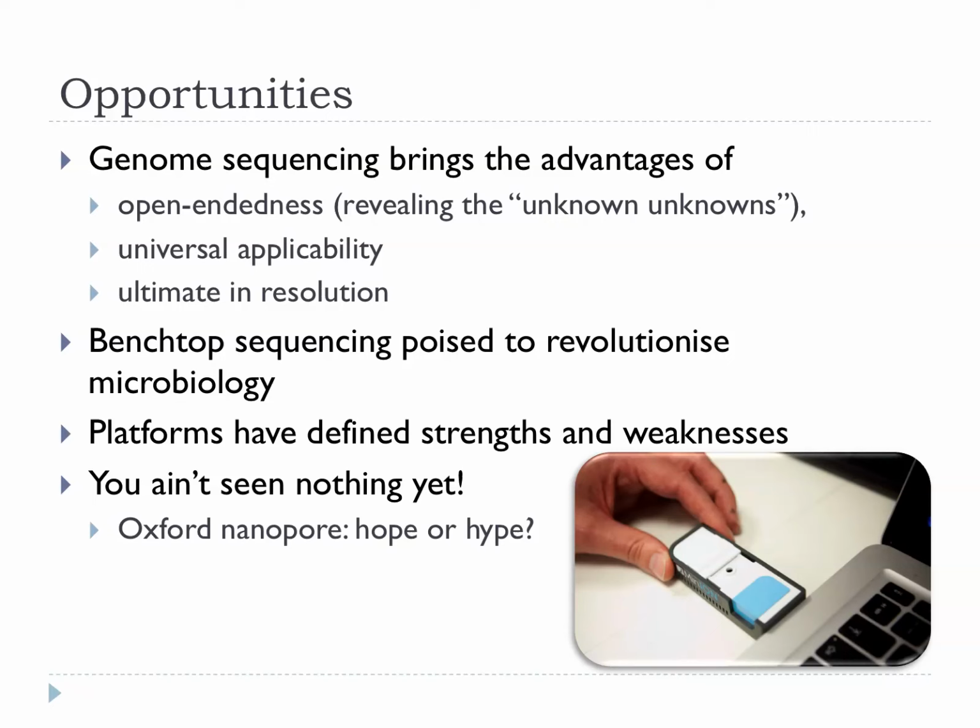So is it hope or is it hype? We don't know. We're all waiting to see when they're actually going to have something that we can all get our hands on and try out. It has to be said, with the Ion Torrent, the hype that went before wasn't matched by the reality when it first came out. They actually released it at rather less spec than we expected. So we don't know, but this will transform the landscape again. All this issue about trying to assemble short reads into contigs and scaffolds will go away if you can get 10,000 base pairs in a single read off an instrument like this for a few hundred dollars.